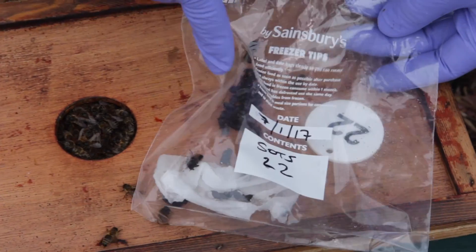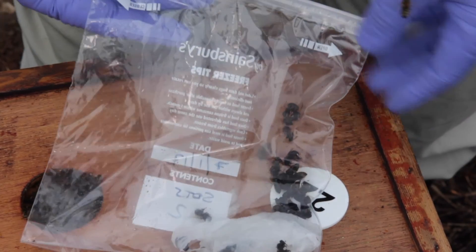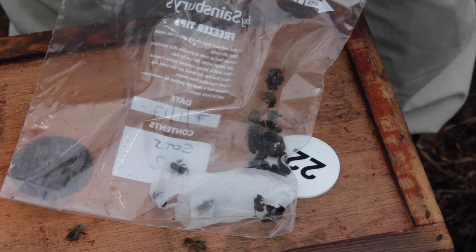That's our sample of bees, and as you can see the bees are already dead, so it works really quickly. It's very humane and we can now take these away and do our tests on them.